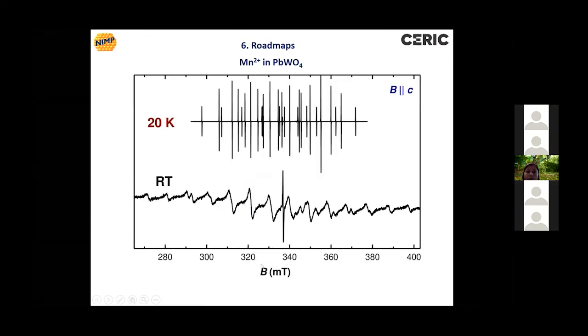But if you look at the spectrum, I recalled the spectrum from the relaxation part. You have as a rule of thumb that the hyperfine interaction provides a hyperfine structure of lines of similar intensity and separated by the same distance. So when you have this complicated spectrum, you look at the lines which have the same intensity, and you start from the outer part of the spectrum and you look 1, 2, 3.